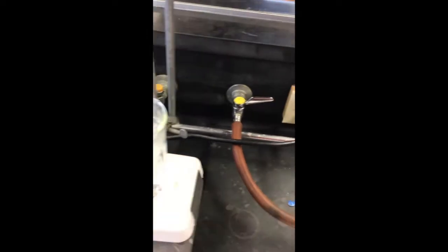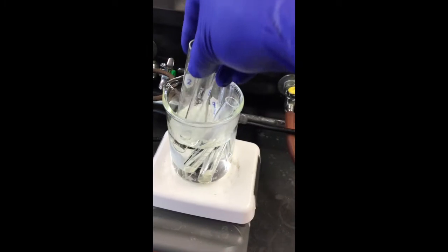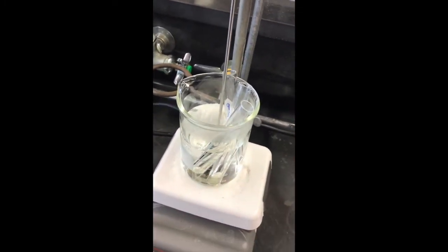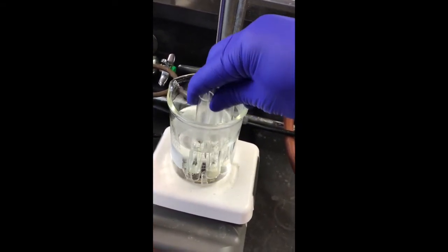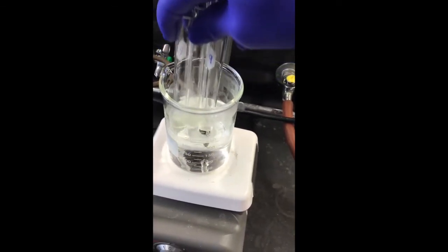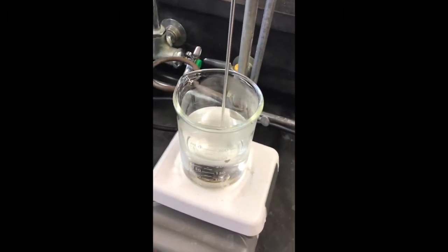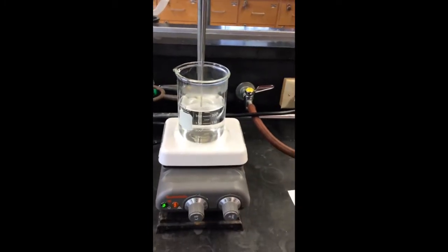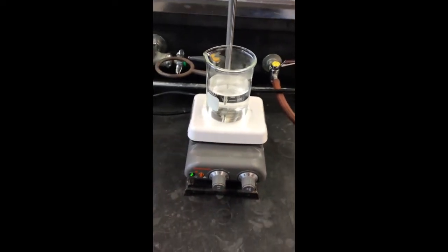One thing I also want to note is why did we only heat to 50? Well, first of all, remember that when you heat a reaction in general, any increase of about 10 degrees approximately doubles the rate of the reaction, right? Super cool, fun little fact. But in addition to that, we have a solvent that does boil around there. So we don't want to go higher than the solvent's boiling point when we're heating it. So that's something you want to keep in mind whenever you're doing a chemical reaction.